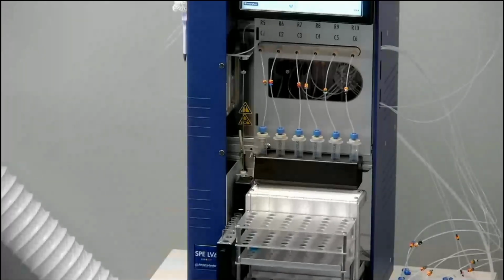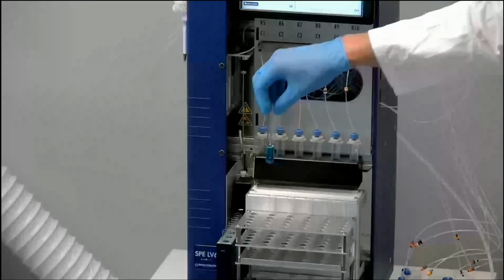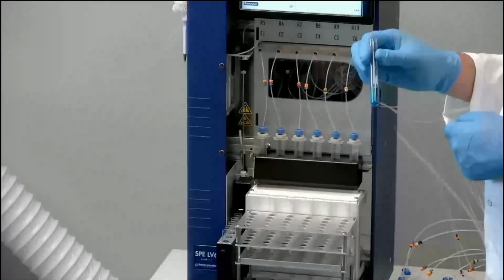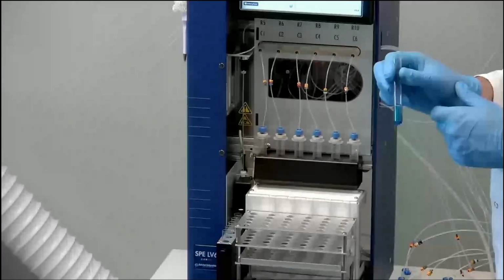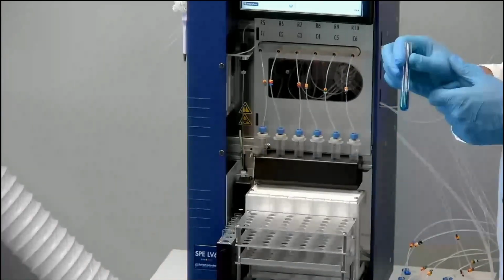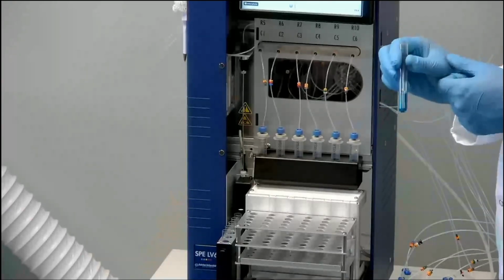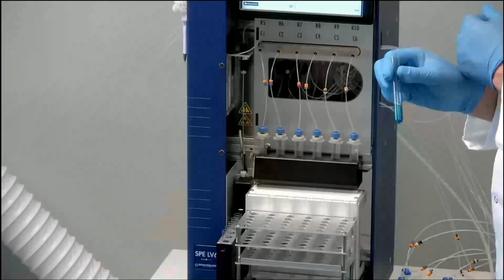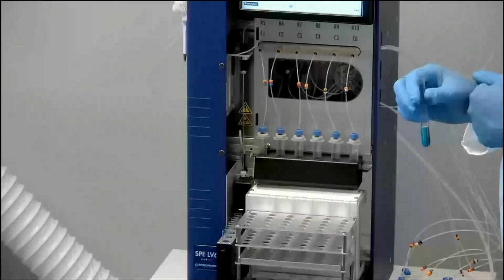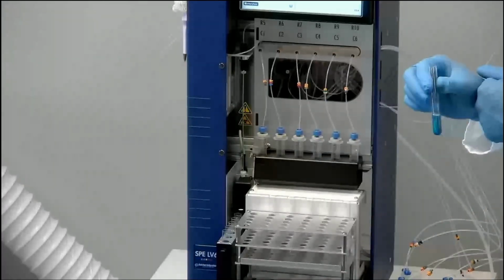It's important to dry and remove as much water as possible from your sample, especially when you put your sample tubes inside a concentrator to evaporate and concentrate your sample. If you have water, you have to increase the temperature to evaporate your elution fraction. That's why with this drying step, you save a lot of time for the concentration step, and you can reduce the evaporation time by 50% at the end of your process.